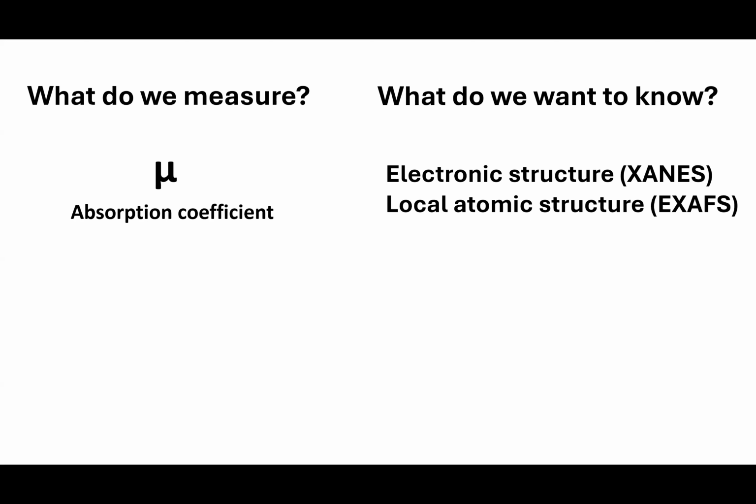But during X-ray absorption, we're creating a lot of, let's say it's the L edge, then we're generating a lot of 2p holes. We're promoting our 2p electron to the 3d. So we have to consider a lot of final states, which are the 2p hole and the 3d one. That's something that carries information in our spectrum. That's something we cannot avoid, and that could potentially complicate our data interpretation.